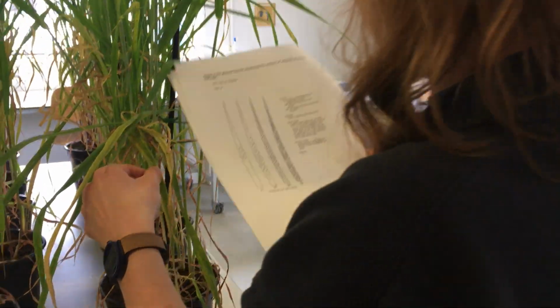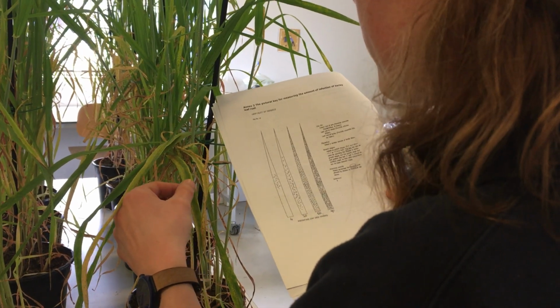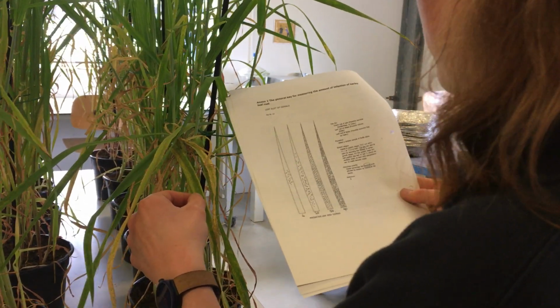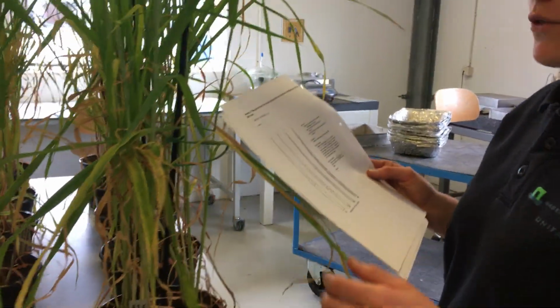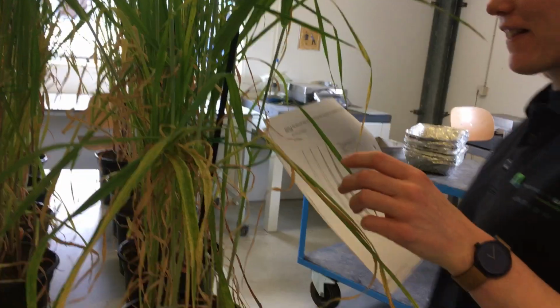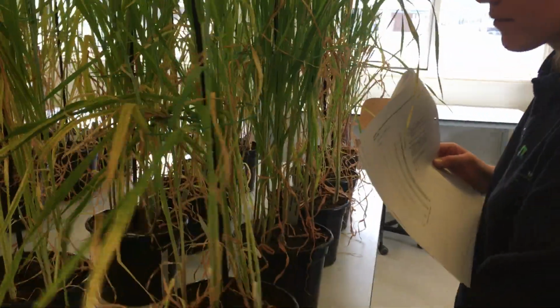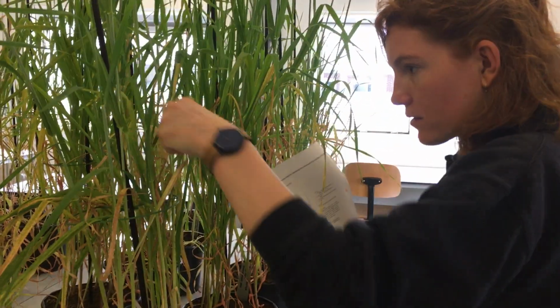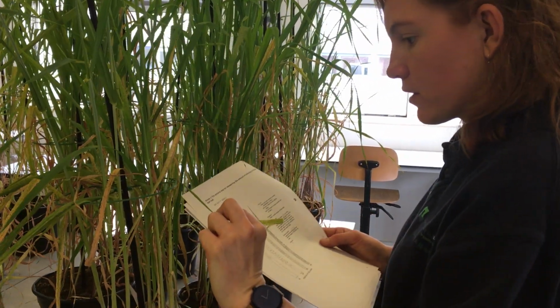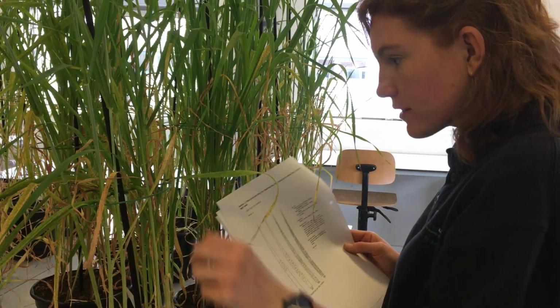Yeah, that's a lot more. That looks more like an 80 to 90. So, 80 to 90. Okay, an average might be around 60 then. If you look, now you have looked at 2 plants, but you need to look at more of this pot, yeah? Then, okay, this one has a little bit of infection too. A 40% on this one.